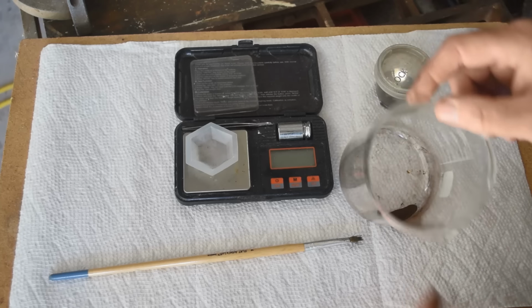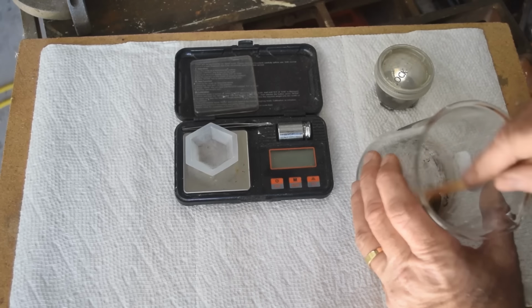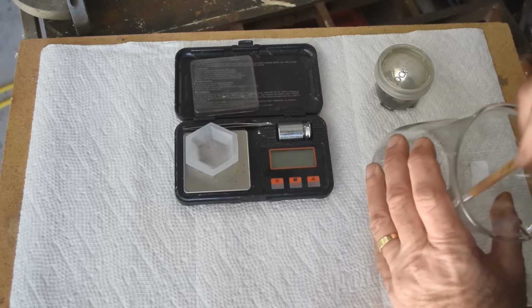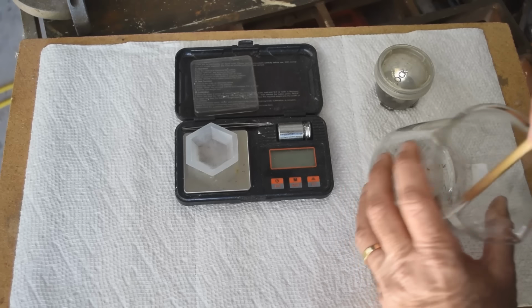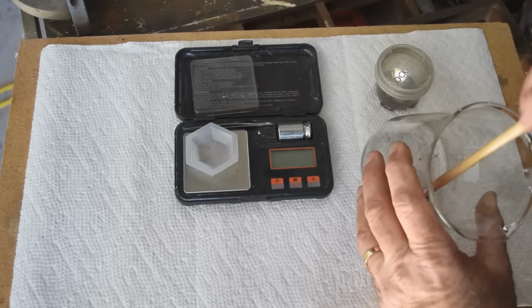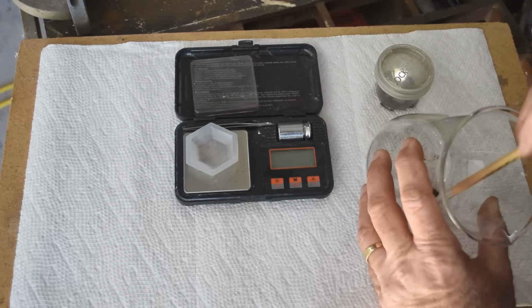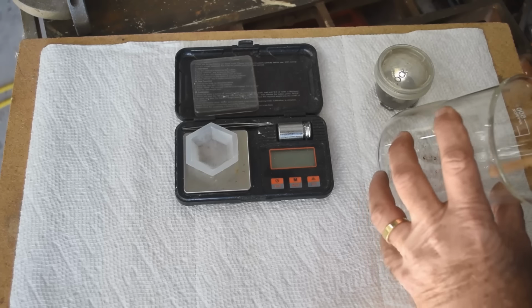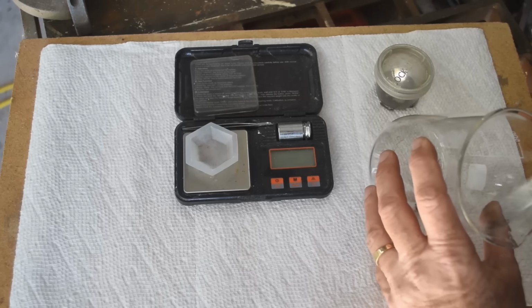All right, I guess it's time finally for a weigh-in. There's not a huge amount of gold here, but I wasn't really expecting there would be. There's some really fine stuff stuck in there. I'm going to have to clean this beaker out and keep the piece of paper towel I wipe it out with. That's one of my little tricks to make sure I don't lose any gold. I wipe out the inside of my beakers with a damp piece of paper towel, get the stuck-on gold off the sides. Then I throw that piece of paper towel in with my filters and rags. I'll get that gold back when I process the filters and rags. So, yeah, there's some really fine stuff stuck in there, but I don't think it's enough to show up on this scale.